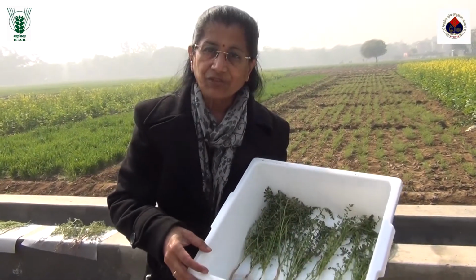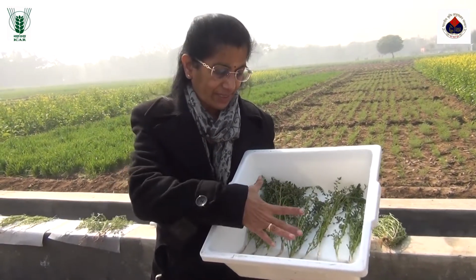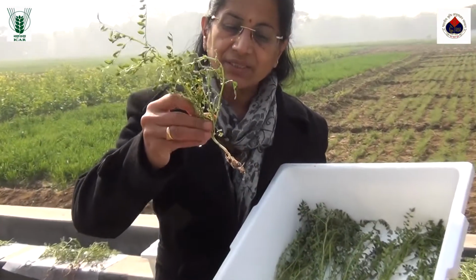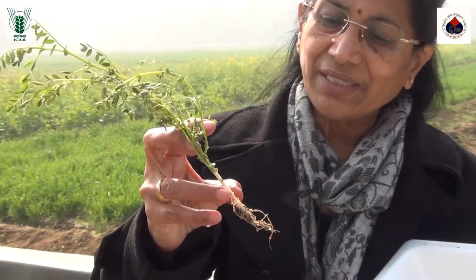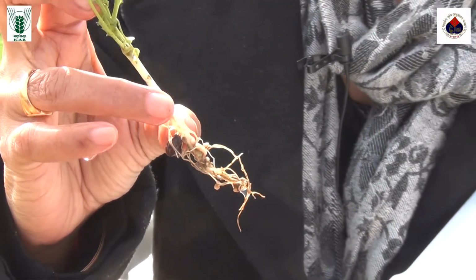These are another set of plants which we have uprooted, washed the soil, and then kept again, and now we are going to take the number of nodules in this. You can also very clearly see the number of nodules here, single nodules and lobed nodules.